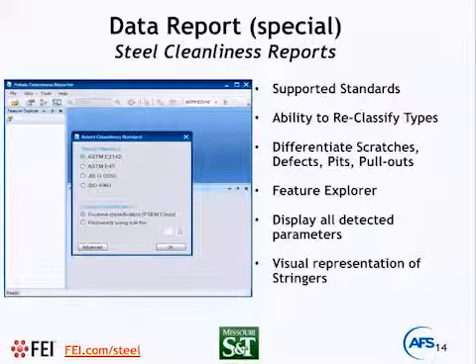So here we have a report template. The same large data set collected by the automated SEM-EDS can be directly reported according to the ASTM E45 standard, and the Japanese Industrial Standard or ISO standard. And lately, we have developed the German steel cleanliness standard, the DIN standard.